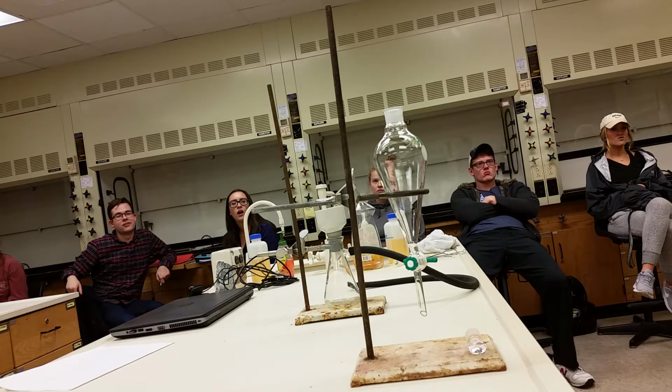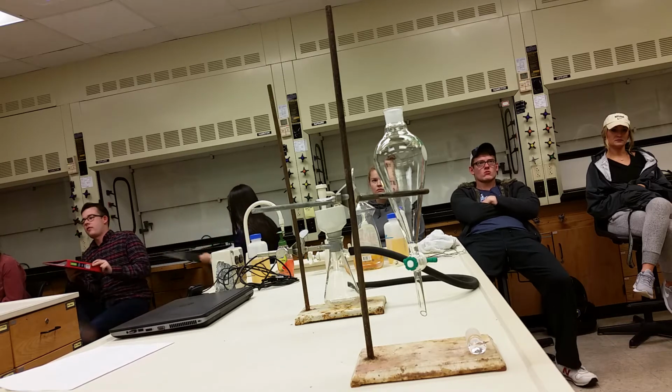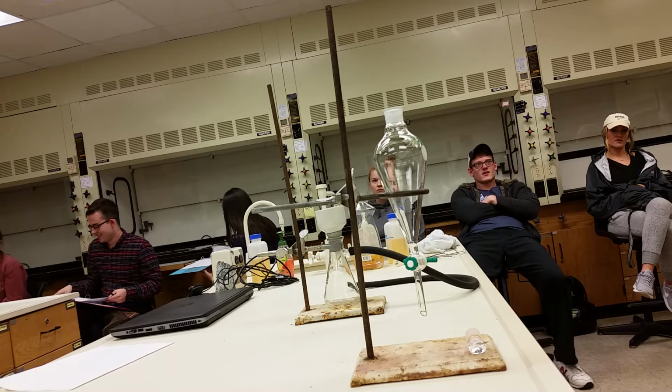Okay, you can do that by two ways. You can go to the SDBS website, which is the spectral database, which is where you'll go to get all the data you need for this lab. Or you can go to Wikipedia. Wikipedia is probably going to be faster.